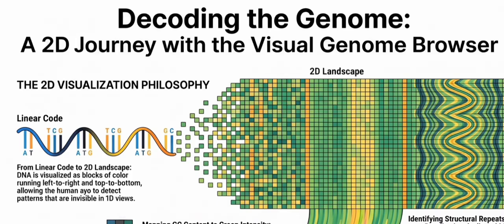When you have a VCF patient overlay active and you position your mouse cursor over the high-resolution DNA view, the software dynamically reassigns the function of those exact same keys. Pressing the less than or greater than keys no longer chapter skips between exons. Instead, the keystroke instantly toggles the visual display between the maternal allele and the paternal allele at that exact coordinate.